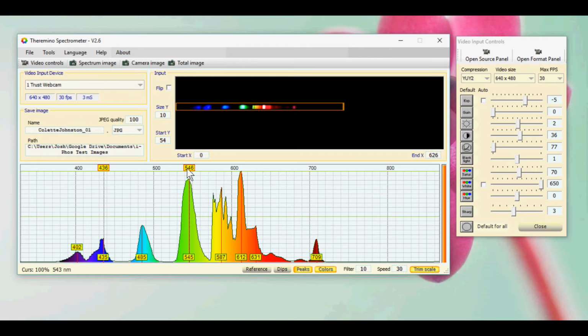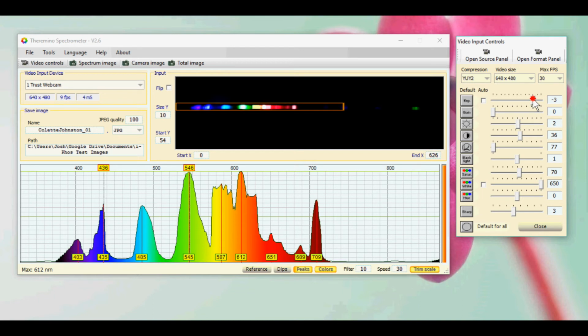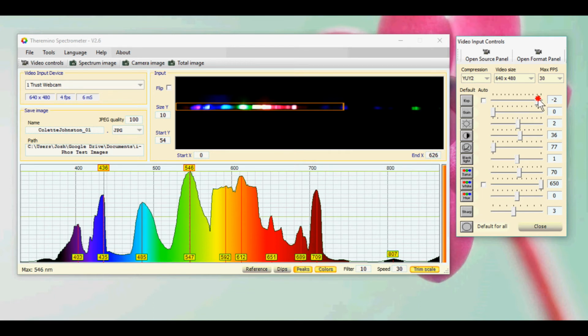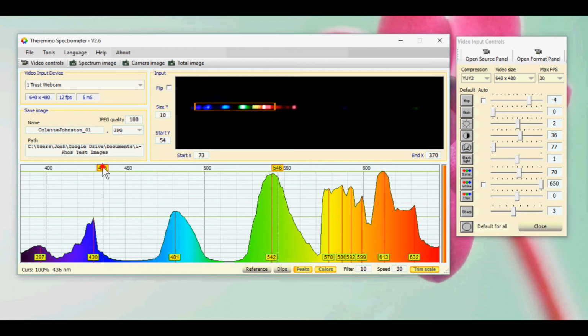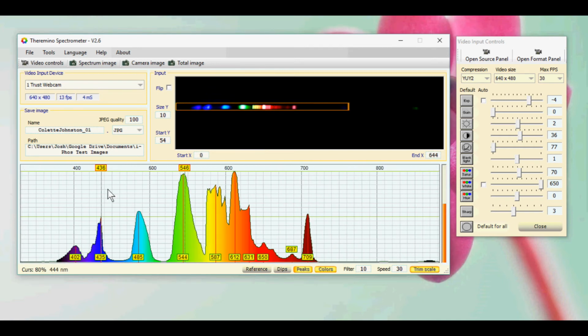But you can do slightly better. So here's a little wrinkle for you. The dynamic range of the webcam is not what it would be on a really expensive spectrometer. It's one of the compromises we make with our i-Phos. And it's easy to overcome that limitation by using the manual exposure key. So if we look at this lower Mercury line at 436, we can see there's some complexity there, and if we manage the exposure, we can see more about exactly what's happening at that peak there. Zoom in, and that might be helpful to make sure that the software is lining up exactly where you want it to on the peak there, and when you zoom out, that alignment will stay put.